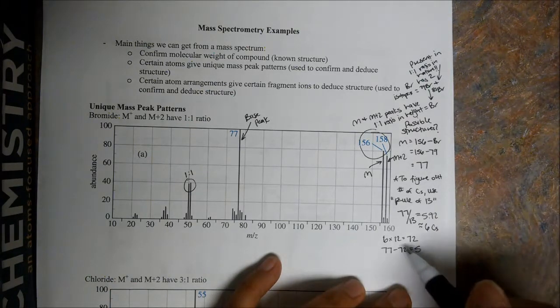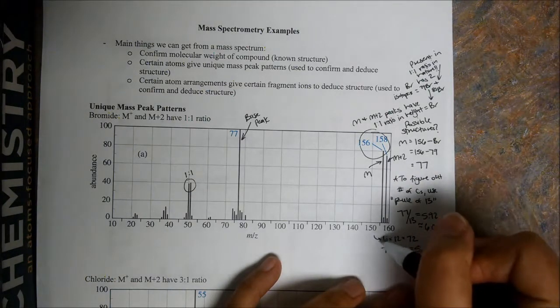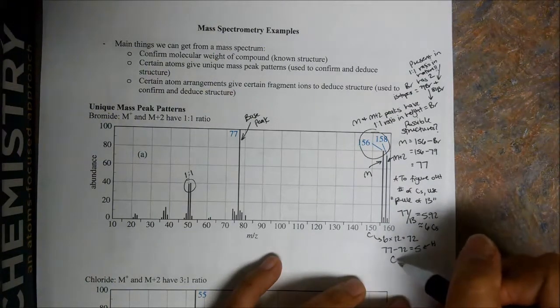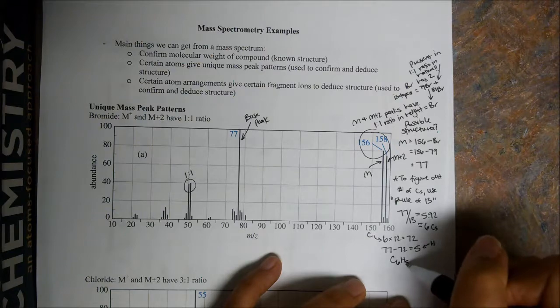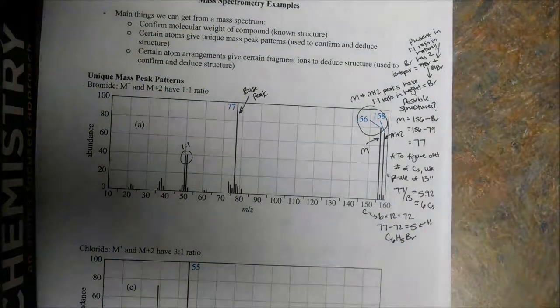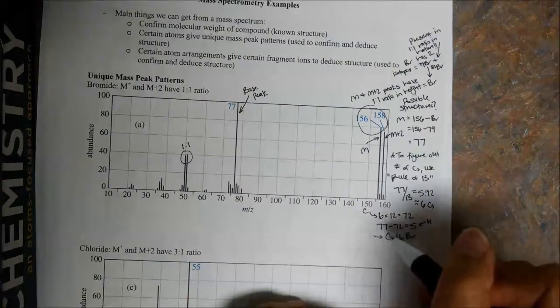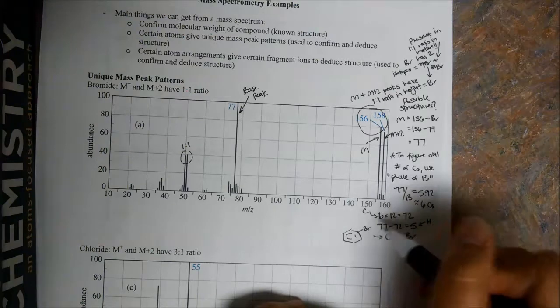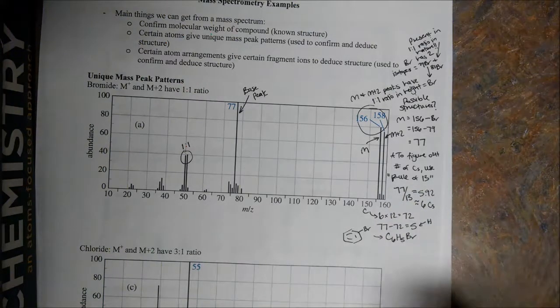So we have 6 carbons, here are our 5 hydrogens, and we have a bromine: C6H5Br. If we imagine what it may be, it's probably this. This is definitely very hard.